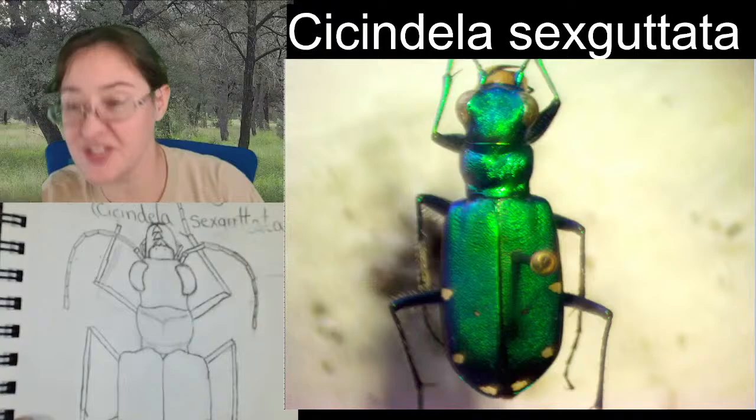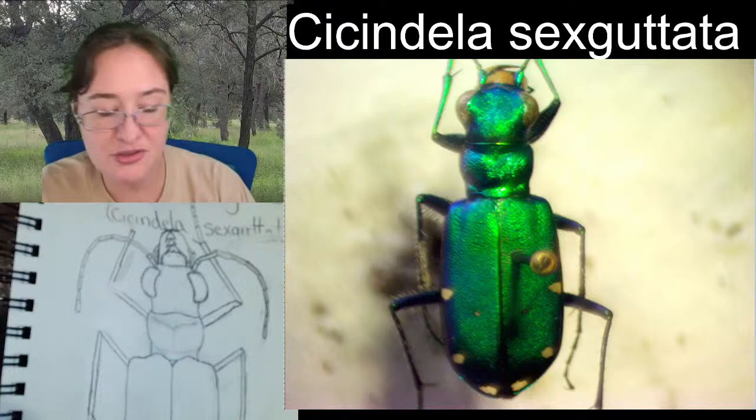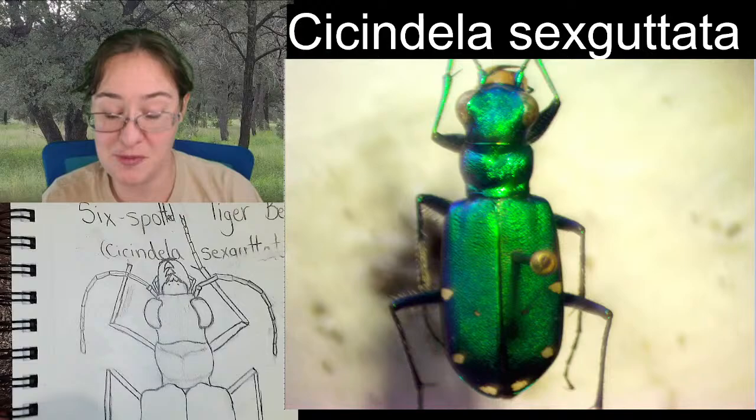Just getting this other left set of legs taken care of before we end our live stream today. We got to talk about all different types of the body parts of our tiger beetles. We got to look at them up close. There weren't very many questions about his structure or body shape or color or anything like that. But my favorite part of looking at tiger beetles is looking at them head on. So that was kind of cool in the beginning.